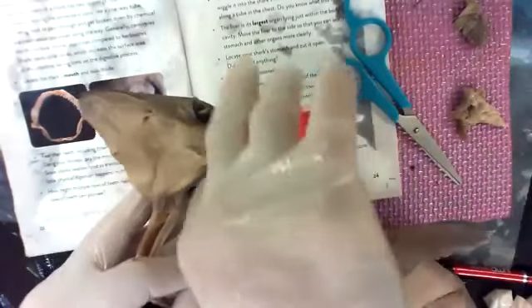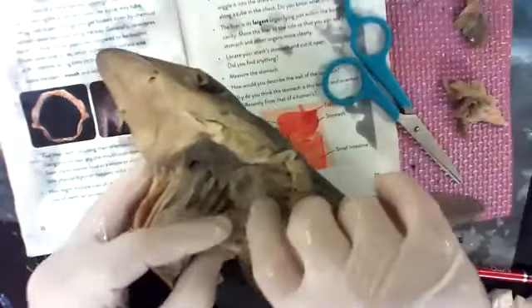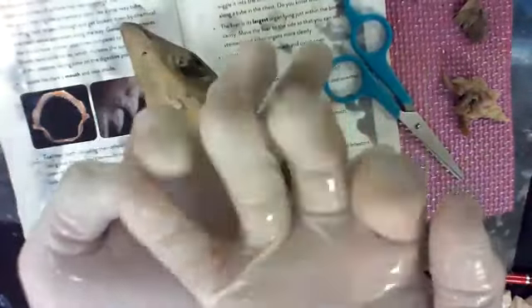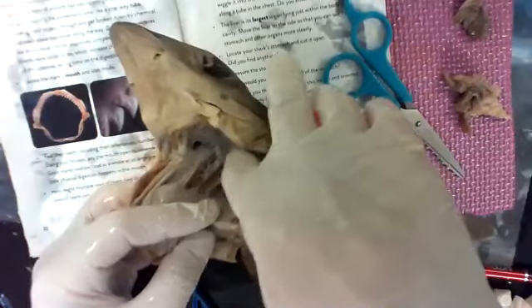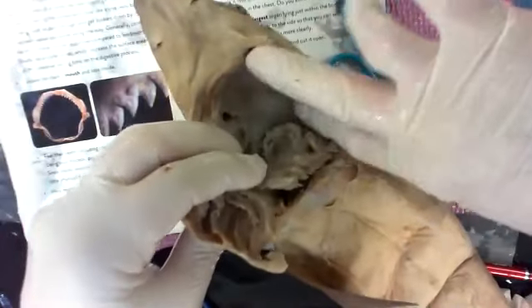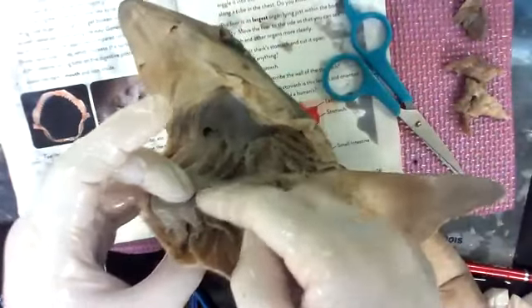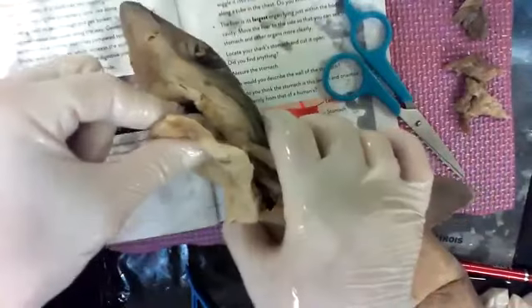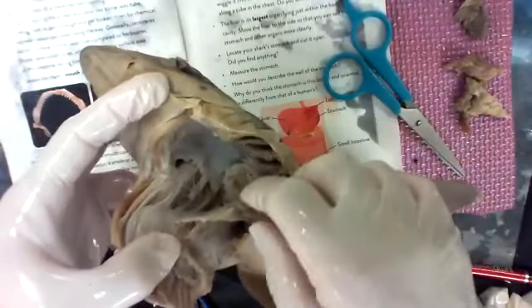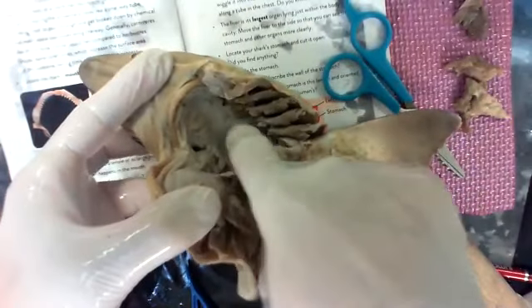Gross. Whew. This one must have vomited because its esophagus is kind of turned inside out. There's more of that. You can see the esophagus right there. See all these, it's like fingers coming up at you. So that once the food gets down in there, those little fingers help hold it in place. You can see the ridges on the back that are like fingerprints. Those ridges are full of taste buds because remember, when it eats and tastes, it doesn't taste with its tongue like you. This tongue is actually cartilage that forces the food up against the roof of the mouth for flavor. So when a shark tastes something, it has to actually take a good bite of it. There's a spiracle. There's the other spiracle.